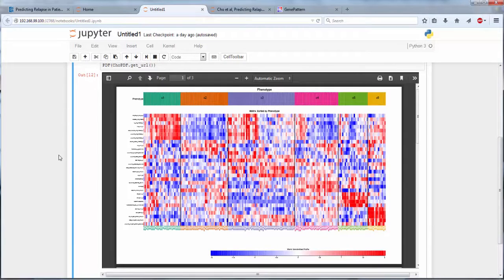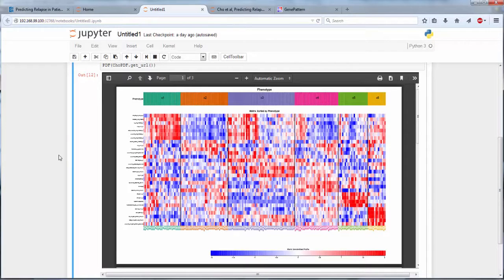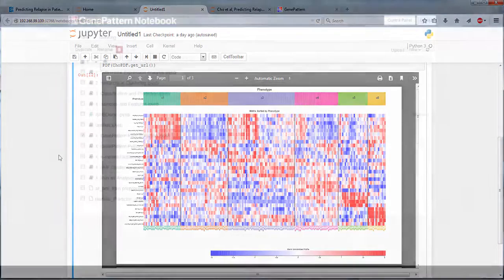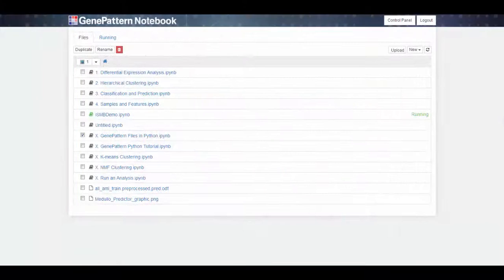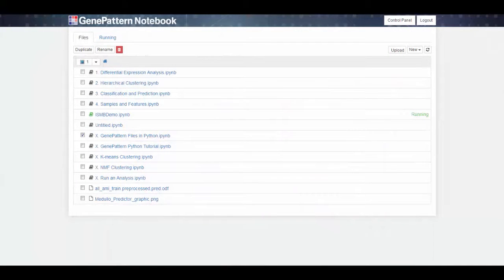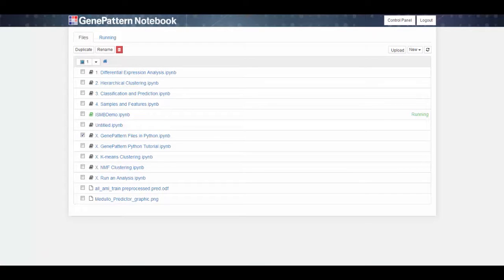As we've seen here, the GenePattern notebook environment is both powerful and easy to use. GenePattern notebook is also easy to access and run. We have developed the GenePattern notebook resource, an online site where you can develop and share your own GenePattern notebooks, as well as access example notebooks.